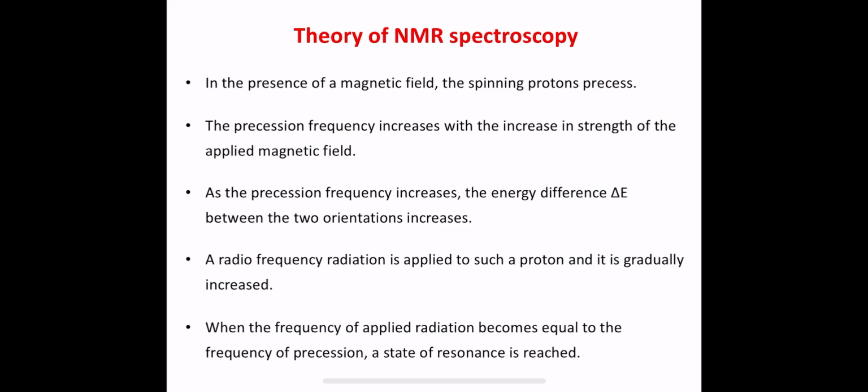Now we will see the principle, or the theory, further. In the presence of a magnetic field, as I told, the spinning protons are going to precess. The precession frequency increases with the increase in strength of the applied magnetic field.